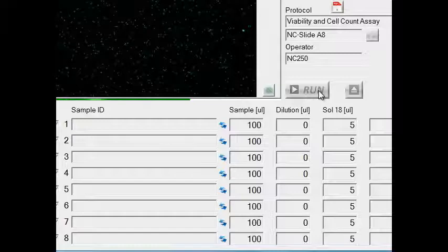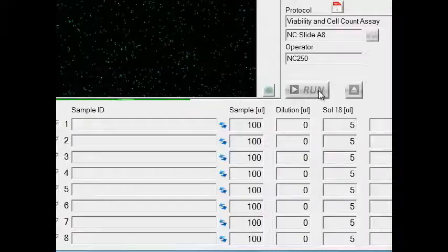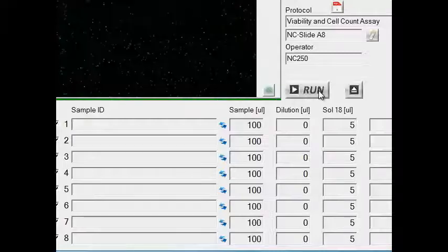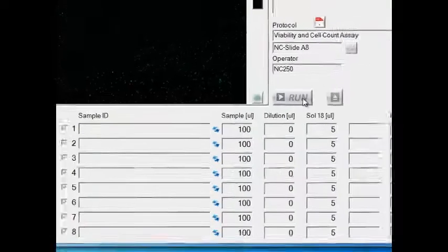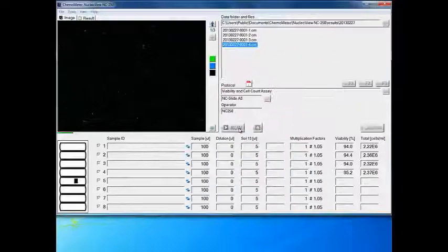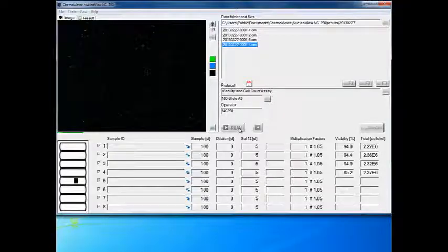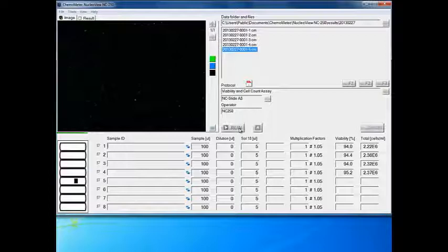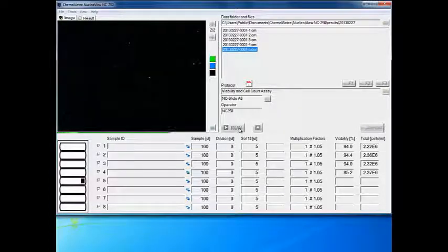Now the slide is positioned and the cells are checked for movement. Solution 18 consists of two fluorescent dyes. One dye, Acridine Orange, stains all cells in the sample, while the other dye, DAPI, only stains the non-viable cells.